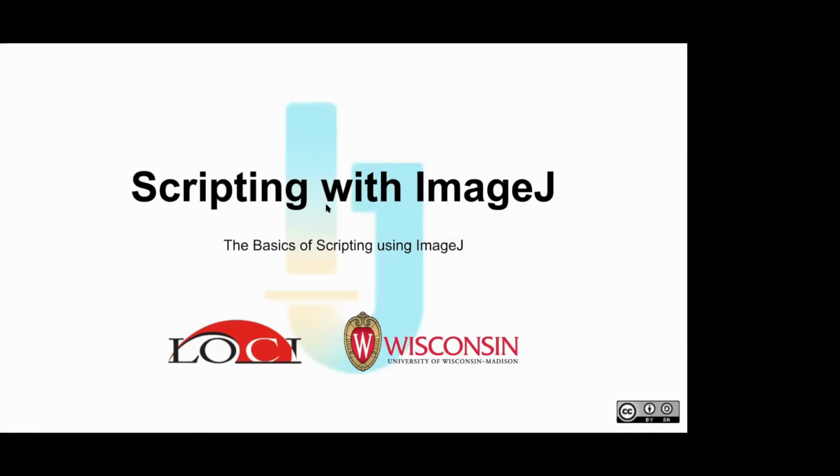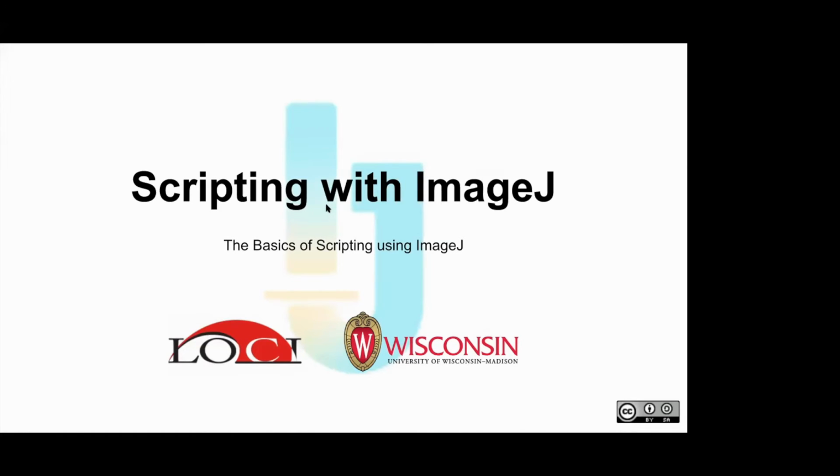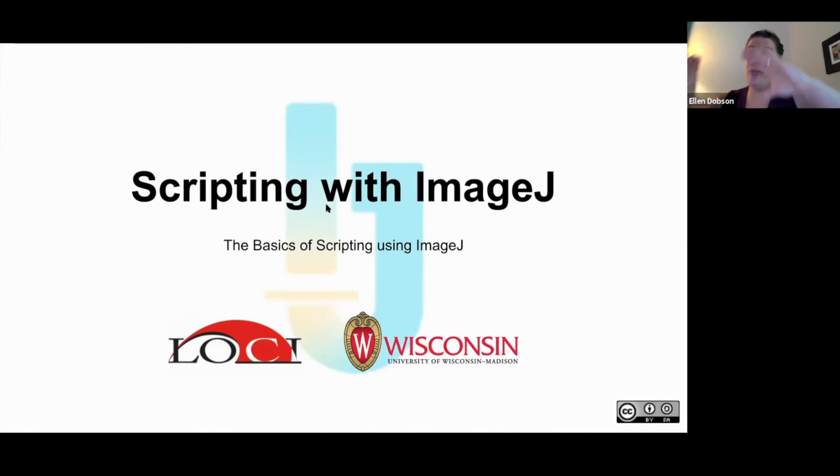Sorry, I think I have read it wrong. The question is, should the DAPI nuclear intensity or area of the nucleus be removed first, but only the antibody intensity is measured? Yeah. So all you'd have to do, if you want to use the nuclei, is segment the nuclei, then overlay that on a second channel and measure the signal of this other channel within.